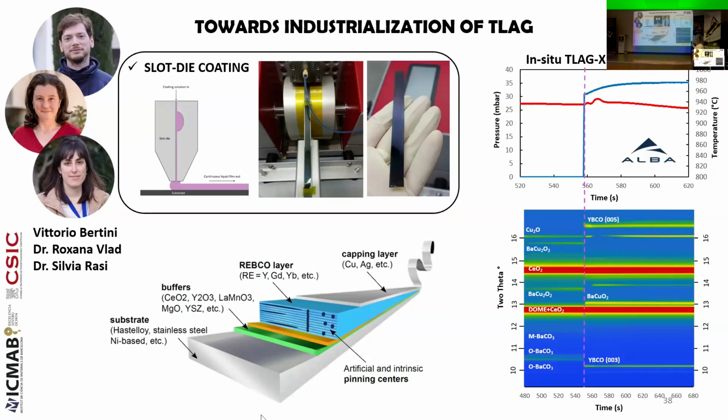So we have even performed some in-situ XRD experiments with the TLAG process with the industrial beam time of the Faraday Factory with our setup and our process, where we got very nice results till now. So this is getting very close to the industrial setting.